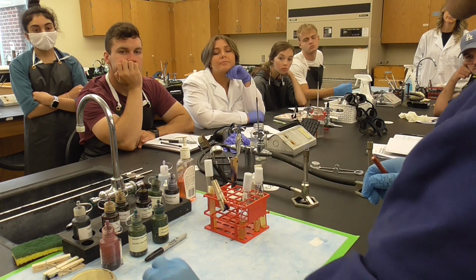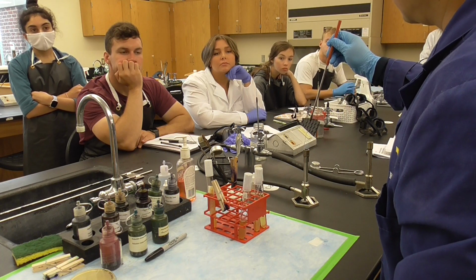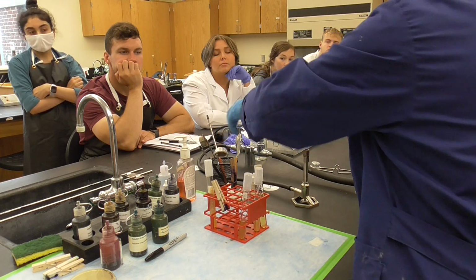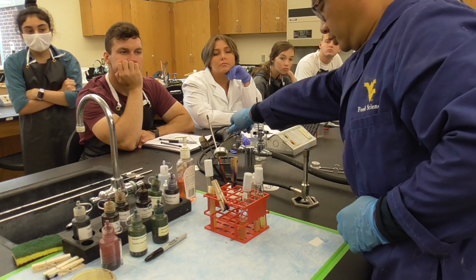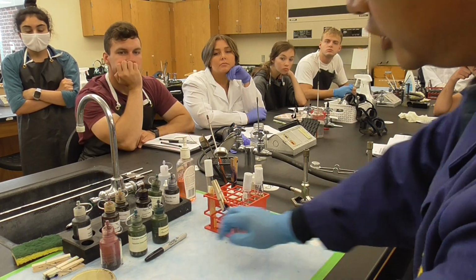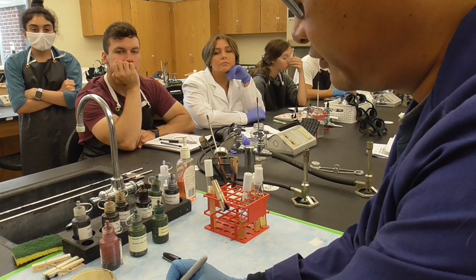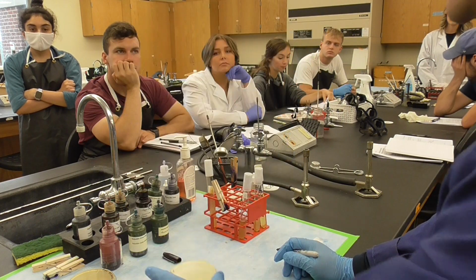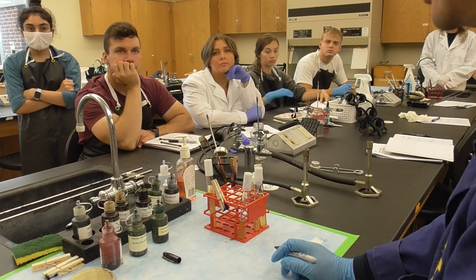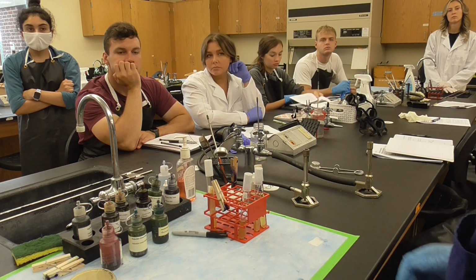And this one will be incubated for 2 different sections. And don't forget to flame this. And the 2 sections will be: one of them we're going to incubate at 25 degrees Celsius. So I would suggest you write 25C there. Another with your bench partner will be at 35C, so you write 35C. The 25C we're only going to put at room temperature because that is 25C.